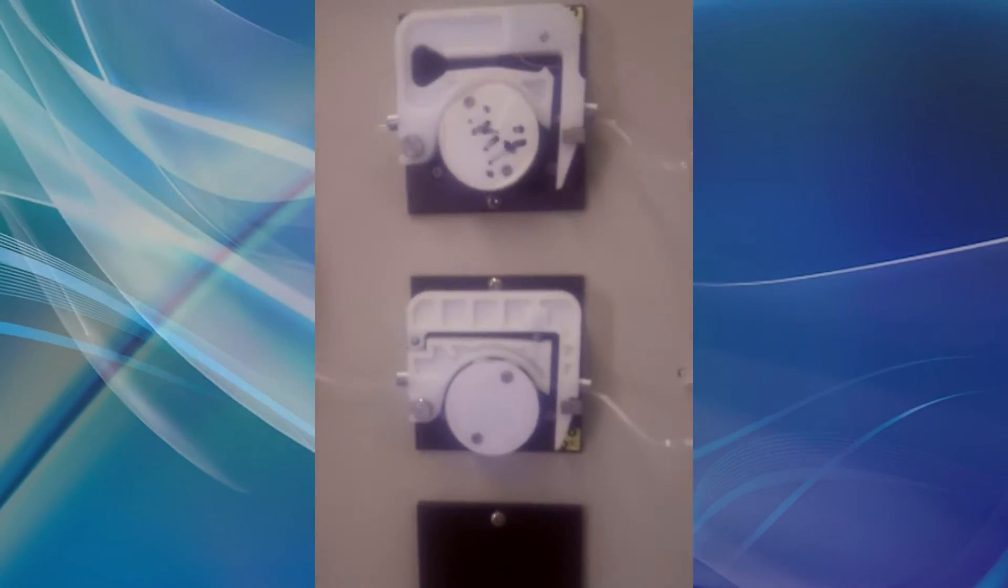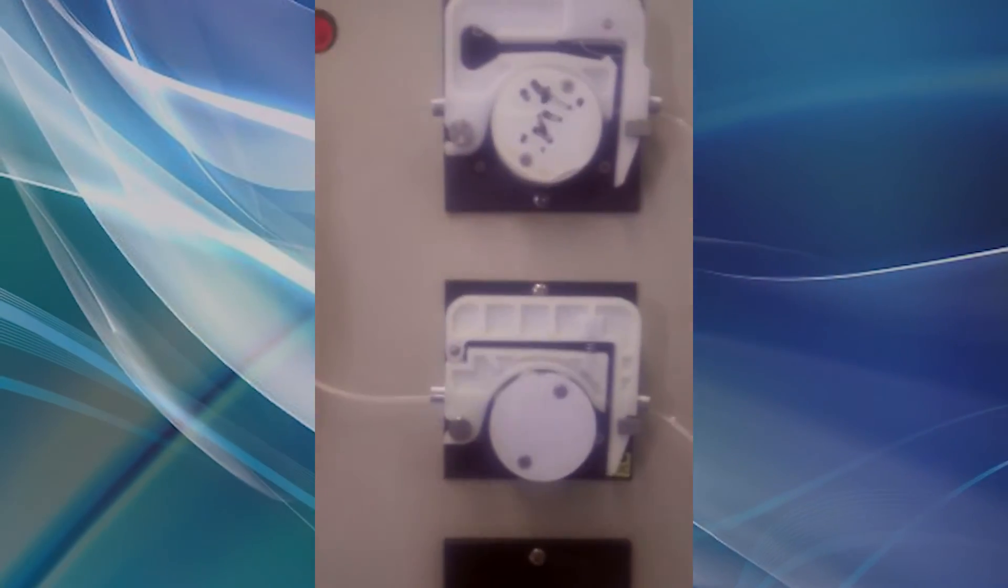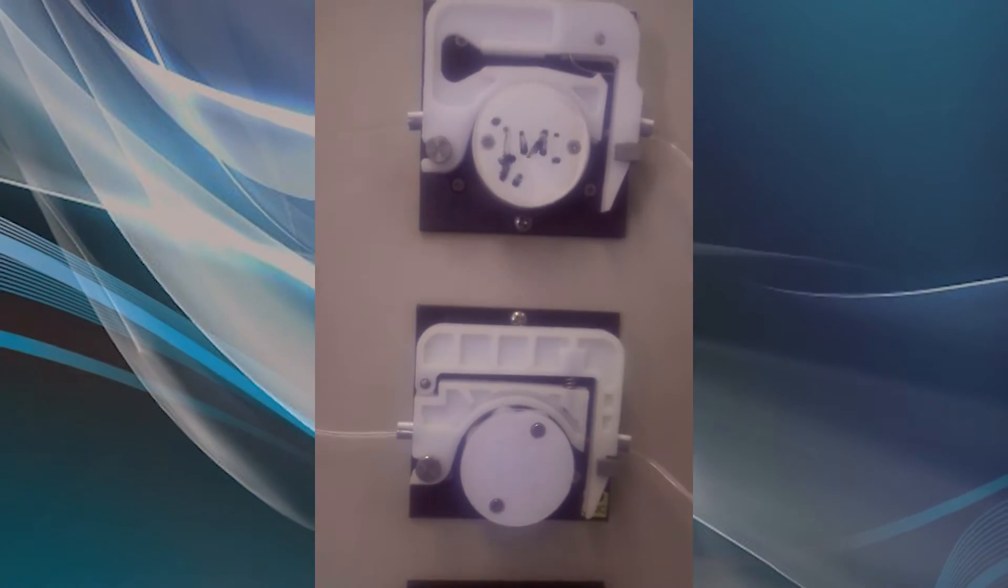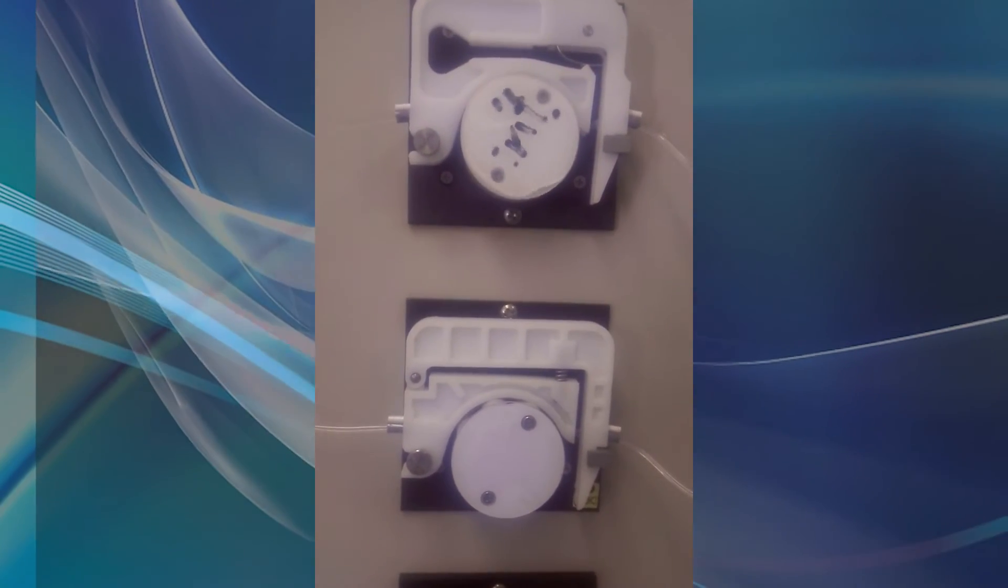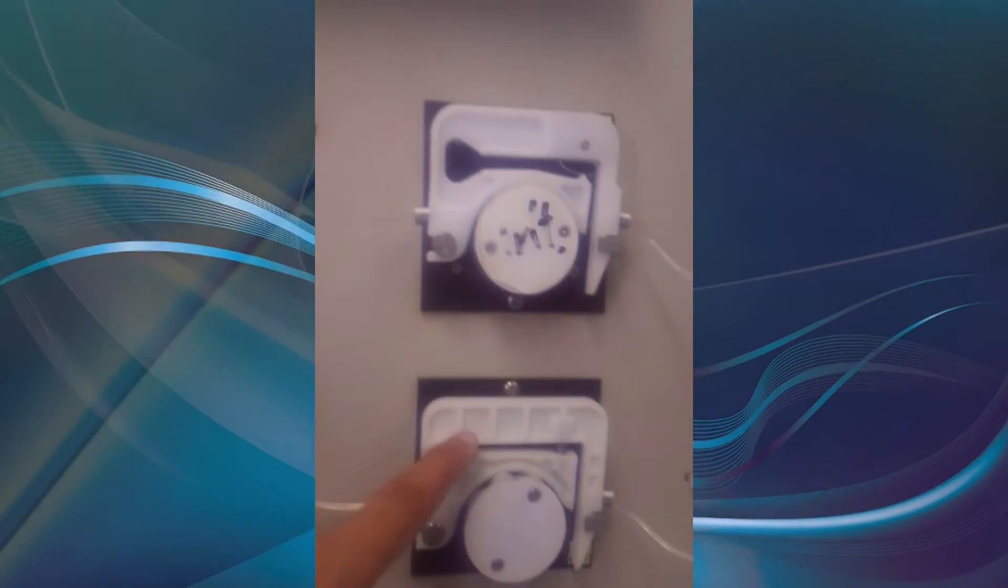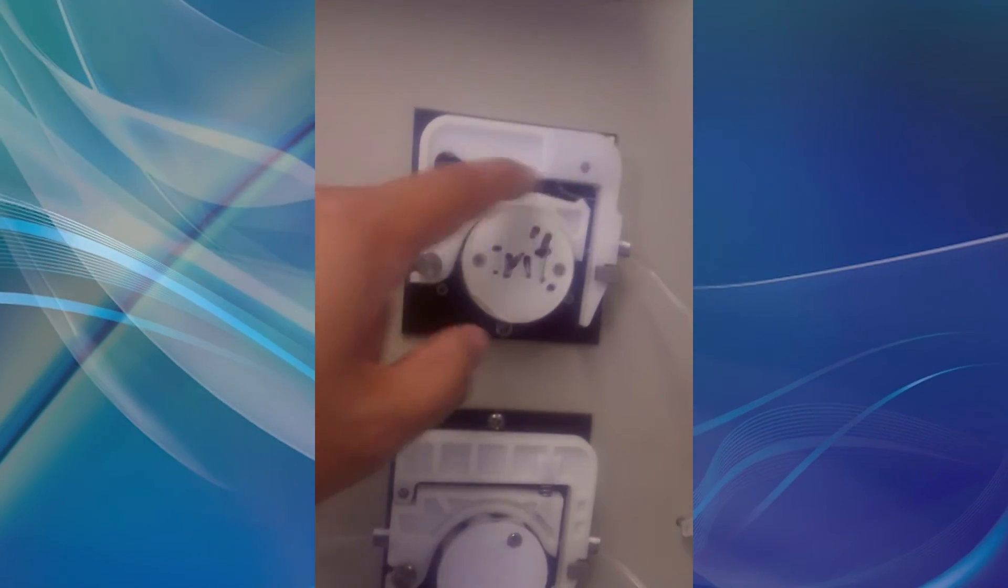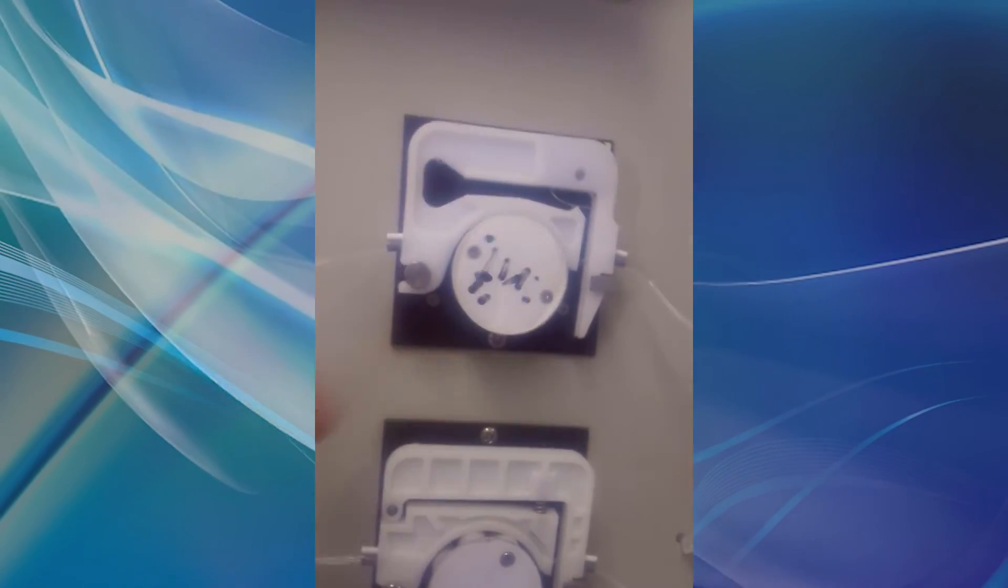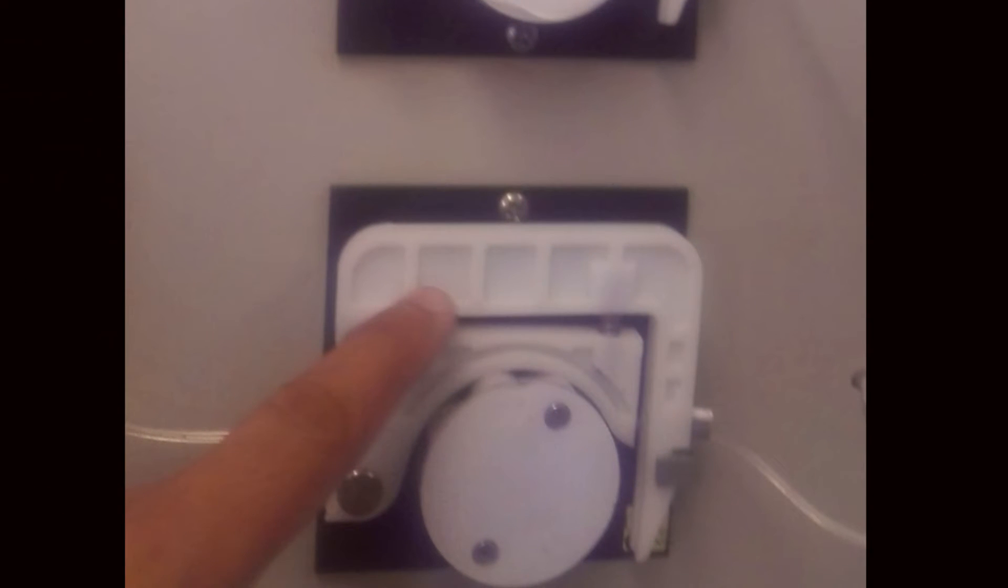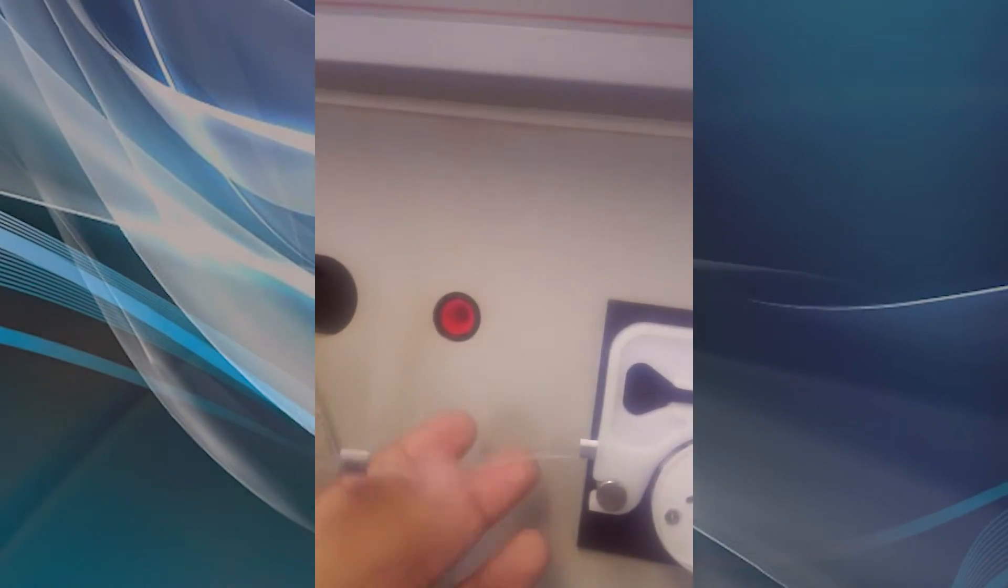These two are reagent pumps. These could be peristaltic or micropiston pumps; in this case, these are peristaltic pumps. One is the conditioner pump to inject conditioner. The second is the titrant pump to inject titrant for titration. This is the pump cassette with Tygon tube with grey-grey specification.